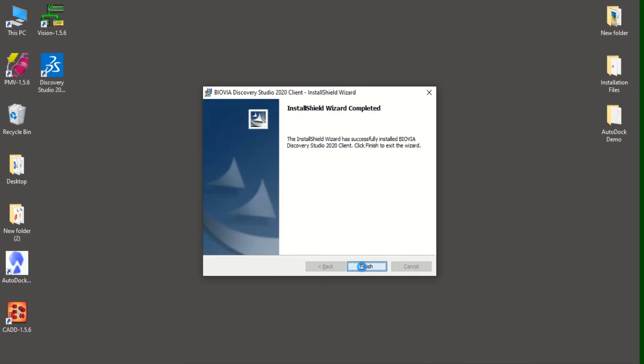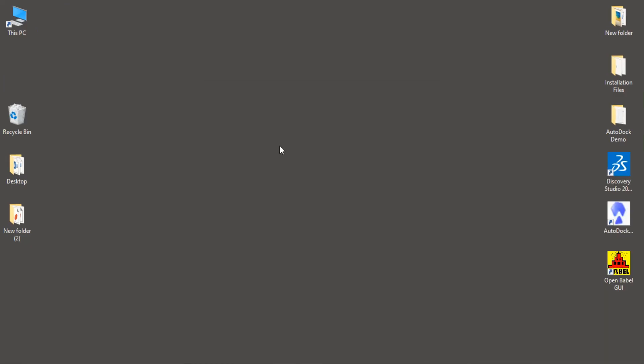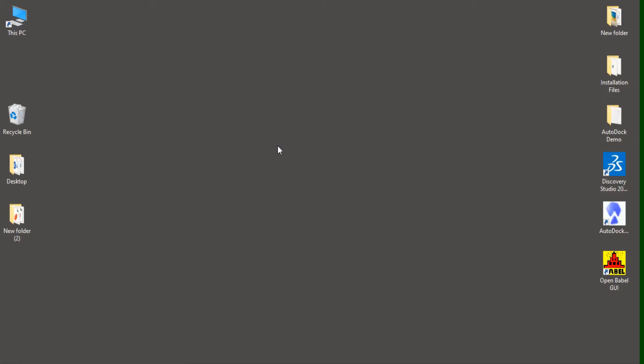So installation was completed. We have installed all the required softwares: MGL tools, AutoDock, OpenBabel and Discovery Studio. Here, these are the icons what we are going to use for running AutoDock. Once, after completing the installation, we have to do some work here. So let me tell you how.